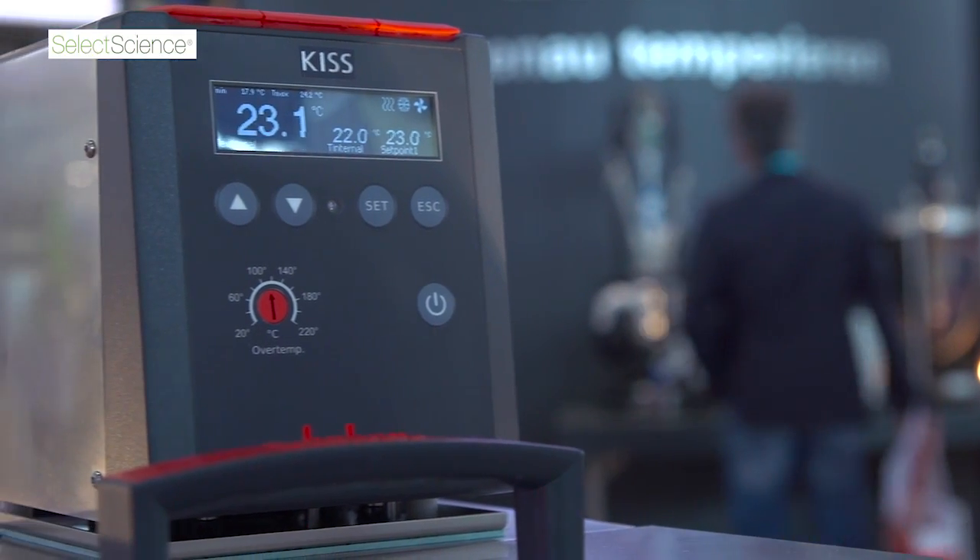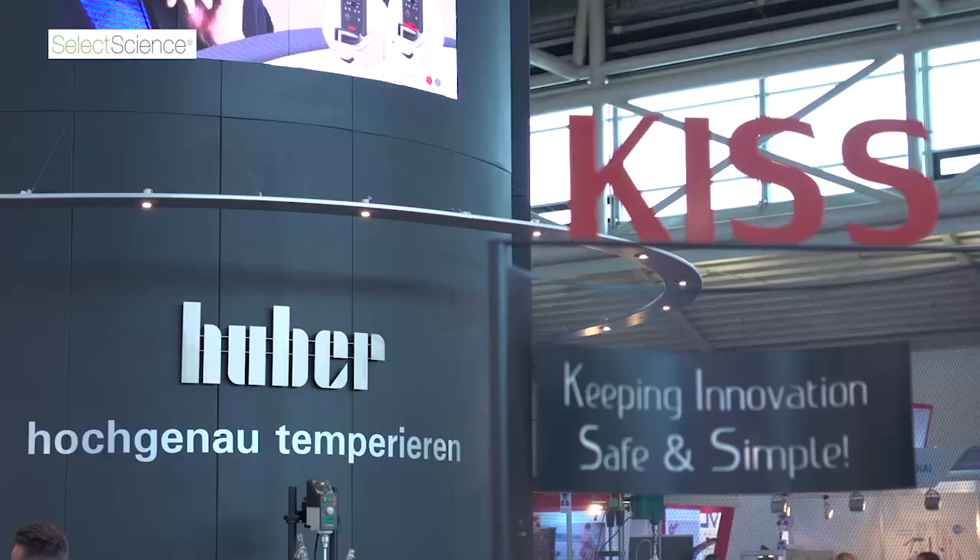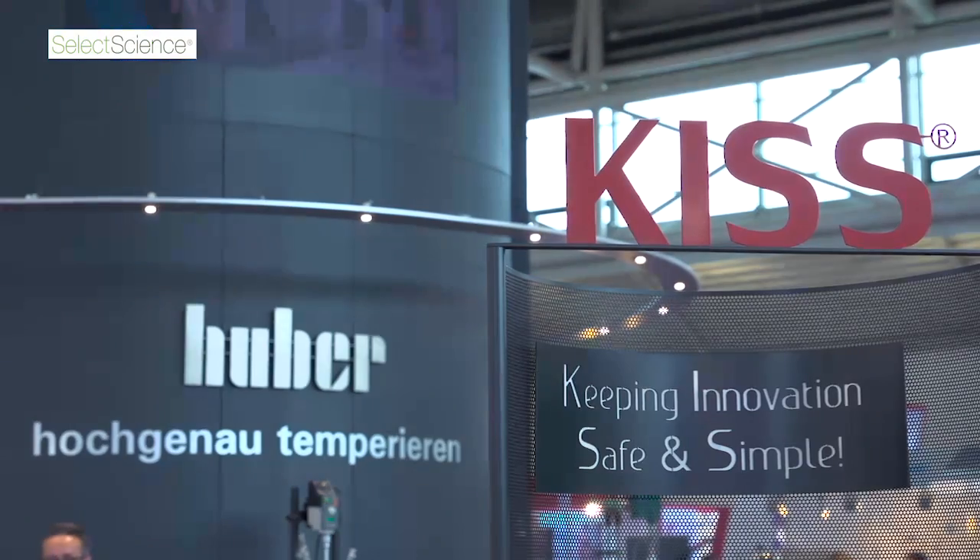My name is Ken McKenzie. I'm the International Sales Manager at Huber, looking after the Asia-Pacific region. Today we're showing our new KISS range of circulators, KISS meaning Keeping Innovation Safe and Simple. The KISS controller is our entry-level controller, our most simple controller, and we use it on our very basic benchtop temperature control systems.